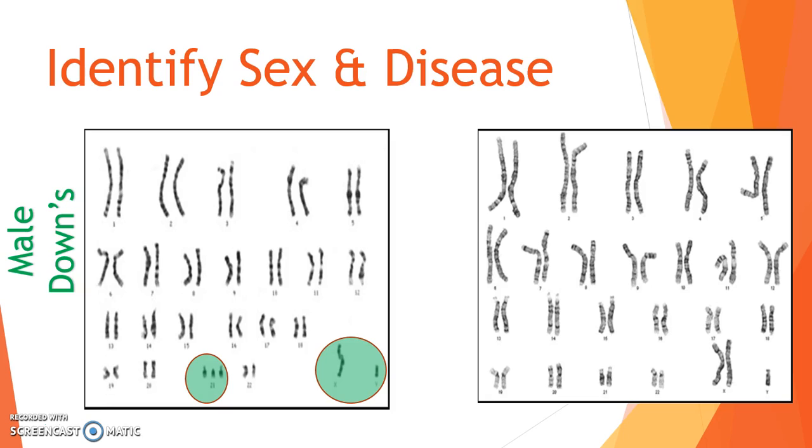For the last karyotype, you might have said that person would be female and have Turner's. But that's where, instead of relying on the chromosomes being numbered, you actually need to count them out. Because if you count them out, you will notice that there are 23 pairs and an extra, which means that this person is not female with Turner's. This person actually has Klinefelter syndrome.